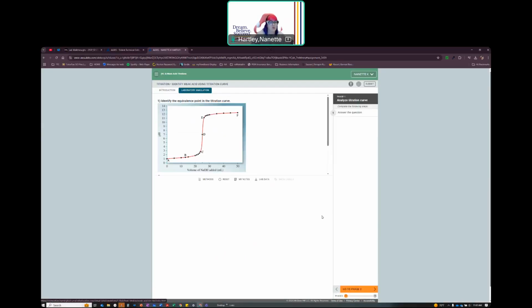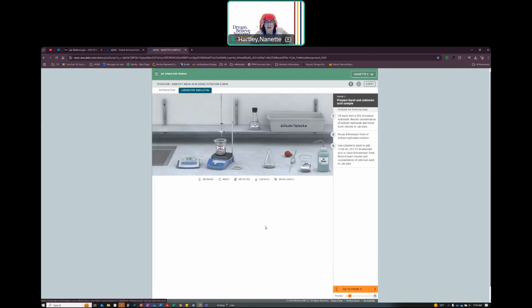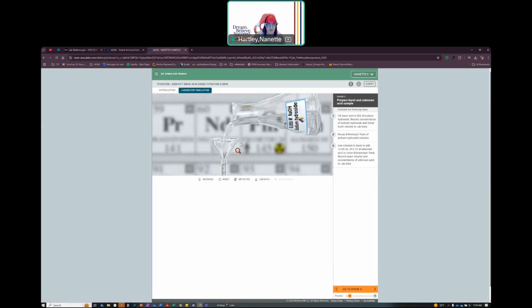Okay. Now we want to identify the equivalence point in the titration curve. In this particular curve, we're talking about D. So I'm going to scroll down to see those. So that is D, and we'll go on. So it says, yay, you know what you're doing. Awesome. We want to fill the burette with the 0.055 molar sodium hydroxide. So I don't necessarily know where we are. So this is my sodium hydroxide. So I can open it up and pour that in there.